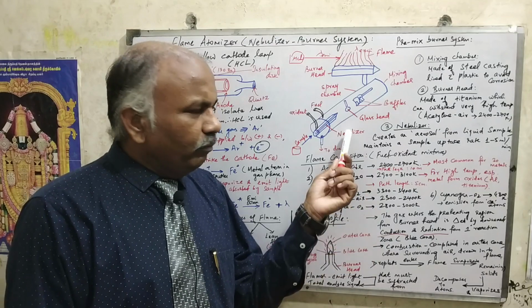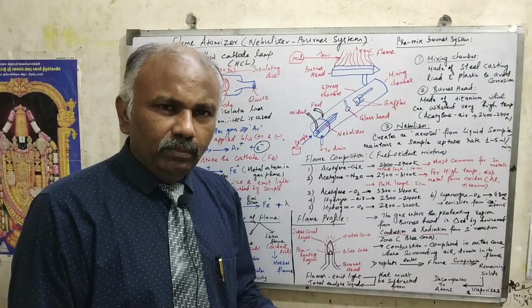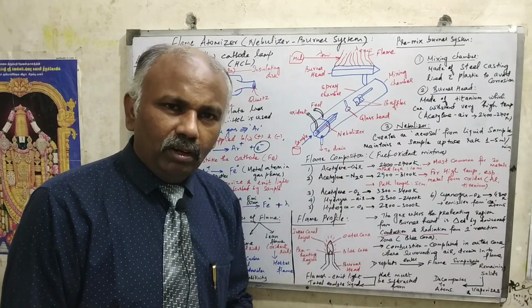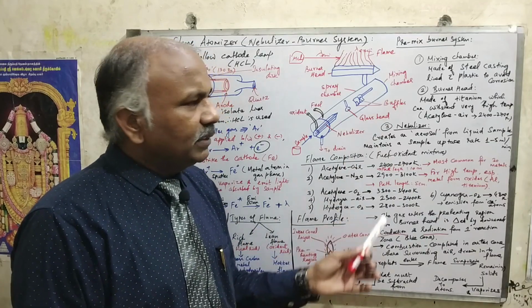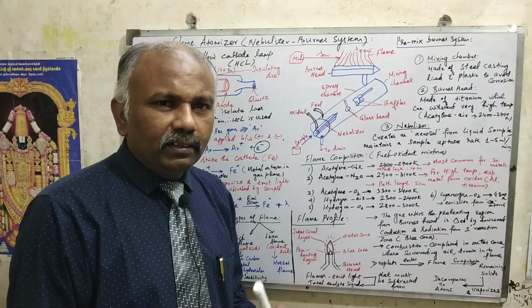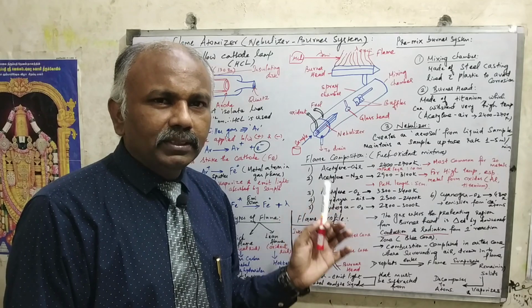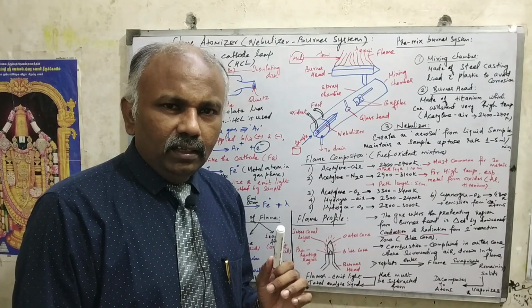Whereas the same flame atomizer can be used for flame photometry, that is, particularly for atomic emission spectrometry. We can use this as a model. Still now we are using this as a model. Okay. So this is the difference you should keep in mind, especially when you are studying this particular topic, right? Because it's a very vast area. One should remember what all the key points are over here. That is very, very important, and to discuss in the class, to remember all those aspects.